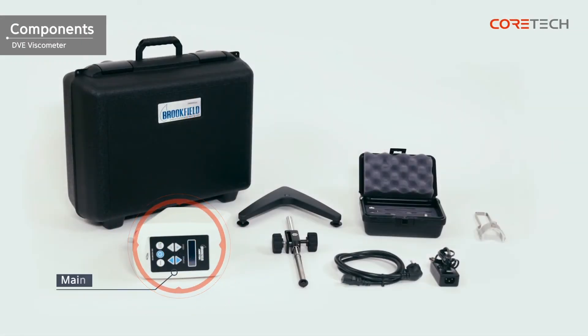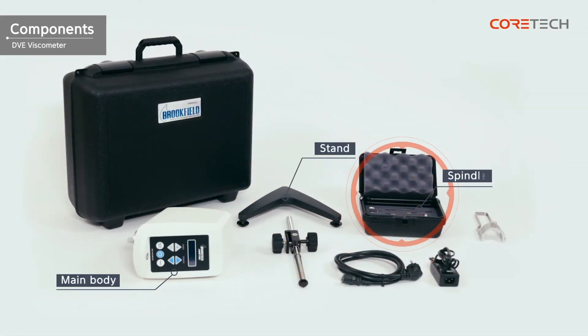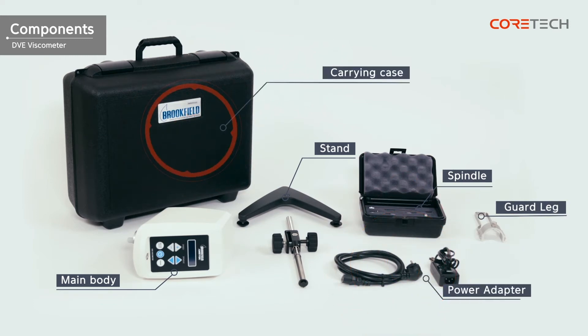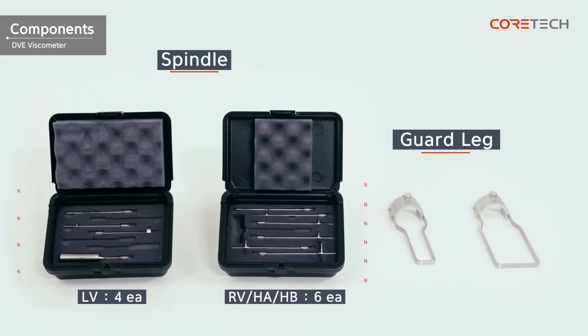The components include the main body, stand, spindle, spindle guard rack, power adapter, and carrying case. The DVE-HA and DVE-HB models do not have spindle guard racks. The DVE-LV has 4 basic spindles, and the rest of the models have 6 spindles. The guard racks on the DVE-LV and DVE-RV are different shapes and incompatible.